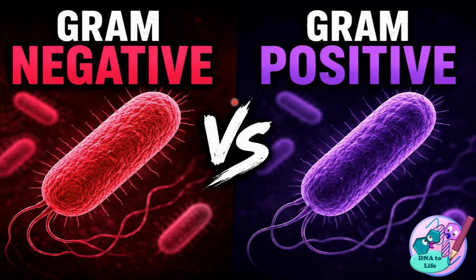Hello everyone, today we will talk about gram negative and gram positive bacteria. Gram positive and gram negative bacteria are classified on the basis of how they retain the gram stain. And this procedure of staining is called gram staining.